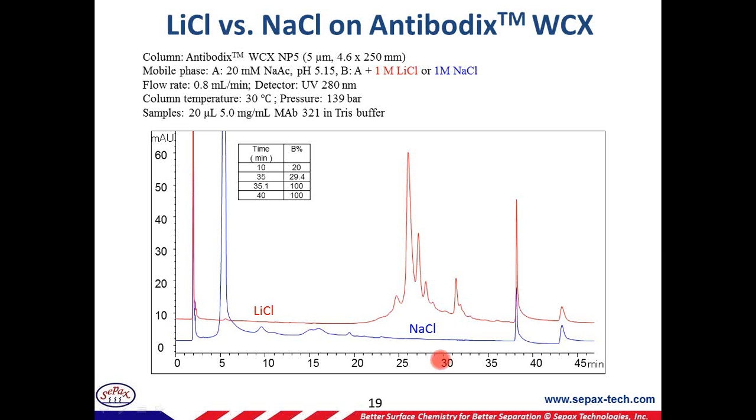However, we did not optimize this gradient for sodium chloride. I imagine if you change some of the ionic strengths, you may be able to improve the separation. However, we do get a really satisfactory separation with the sodium acetate and lithium chloride gradient.